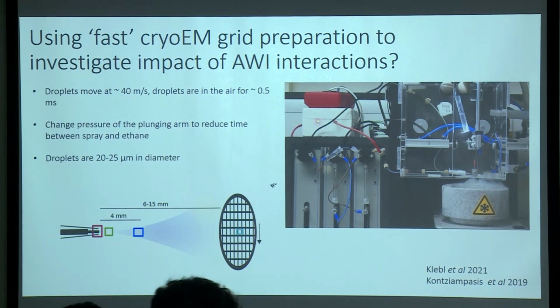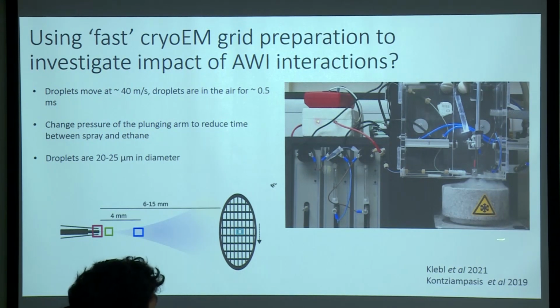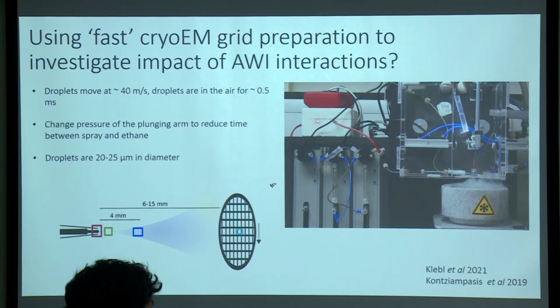So we came at this and started to ask, can we possibly use this technology to study how proteins are behaving in this thin film environment over time? And can we use that to design better strategies for our single particle cryo-electron microscopy? So yeah, thank you. Without the aggressive sounds now. This is a real-time video, so you can see this pneumatic arm is really plunging very quickly.